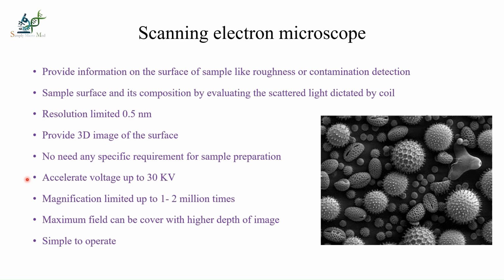It accelerates voltage up to 30 kV. The magnification is limited to 1 to 2 million times, and the maximum field can be covered with a higher depth of image. When comparing to other electron microscopes, this procedure is very simple to operate.